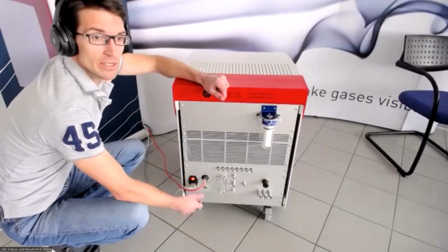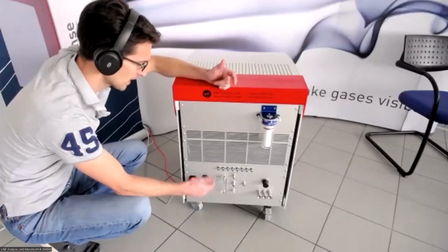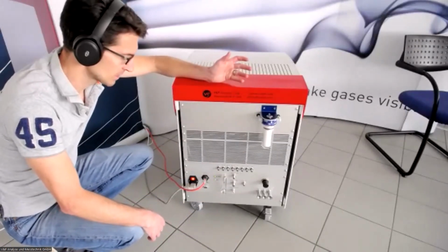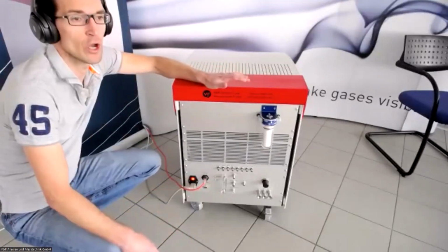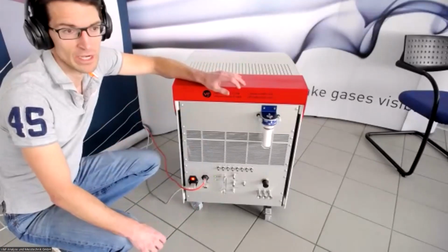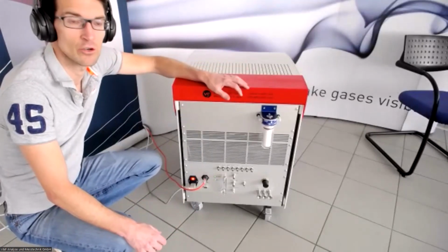The next thing that we have here is an Ethernet connection. This is what I've also mentioned briefly before. This Ethernet connection, in our case, will go into our company network. And then we have our control PC where I'll be sitting, which is in the same network. Therefore, the instrument can be accessed pretty much from any point as long as you're in the same network range, which is rather convenient because if the instrument is standing, I don't know, a few hundred meters away at a test cell and you want to have a look at it, you can also do that from another building as long as you have a network connection to the instrument.